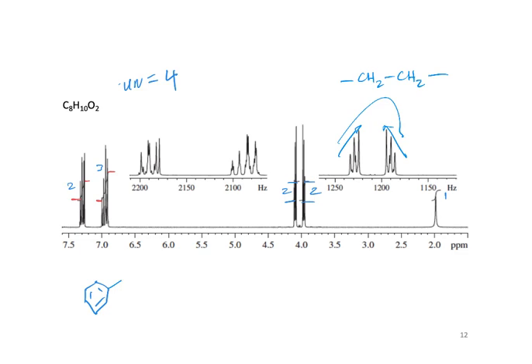If they were first order, they would be 2 triplets. But because their chemical shift has come closer together, remember those simulations of the second order coupling effects we saw the other day? I don't have them in these notes. So I think it's just 2 CH2s. They're 2 triplets, but because their chemical shifts are close together, they're second order.